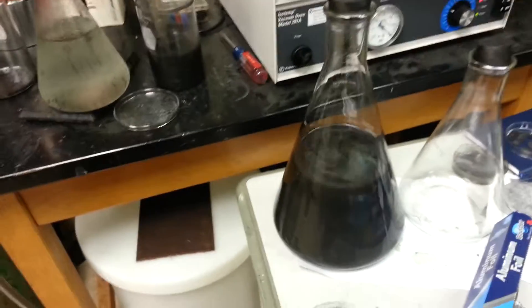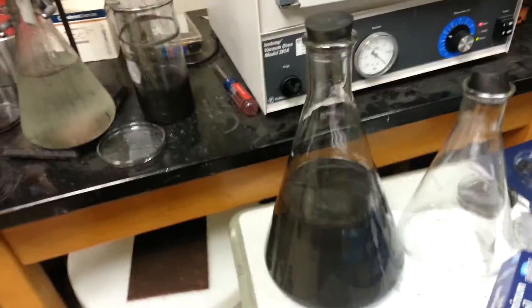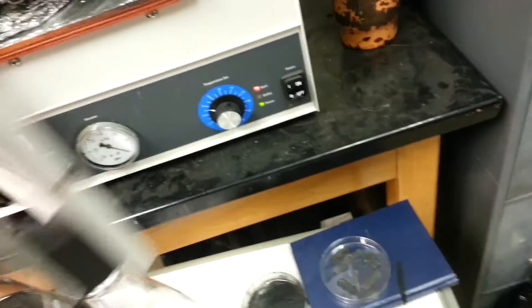Who likes graphene in solution? Not me. I'd rather have it like this — a powdered form that has flaked off. It actually forms a cake first through the filtration process, and then you pull it, put it in the oven, and dry it out. Ta-da.